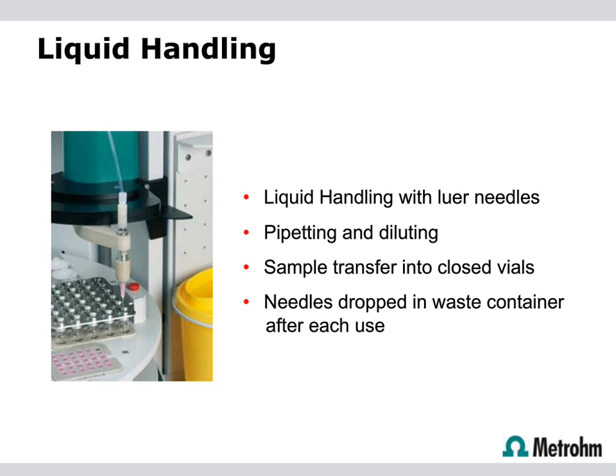So again, most people have standard XYZ auto samplers, and these are the typical HPLC vials that you would fit in them. So you literally inject the sample into the vial. The vials are then taken off the processor unit and placed on your HPLC system and injected directly.